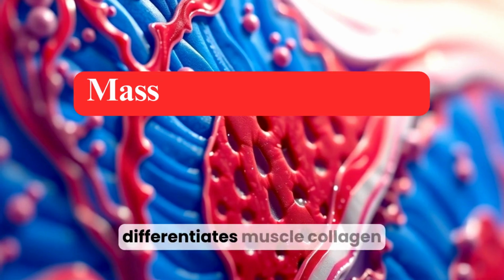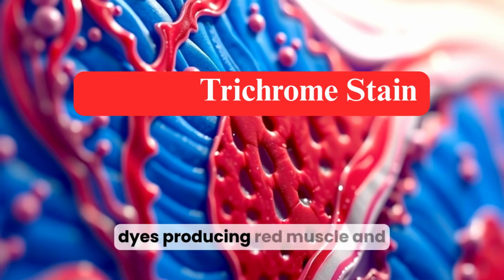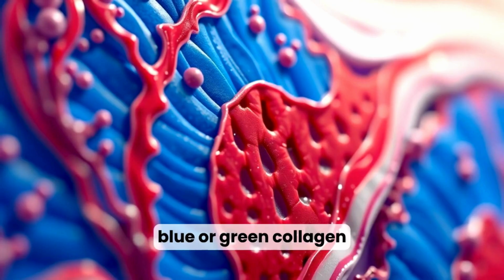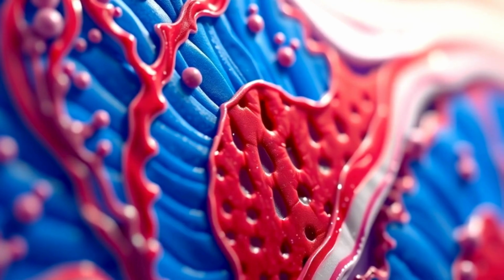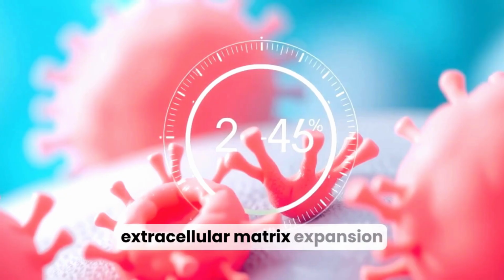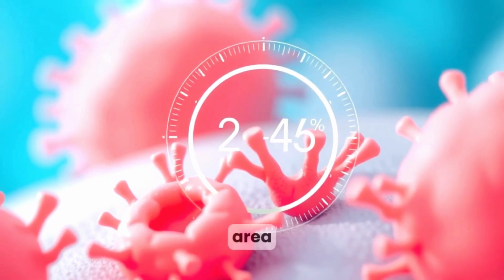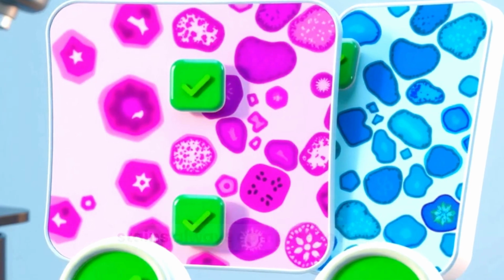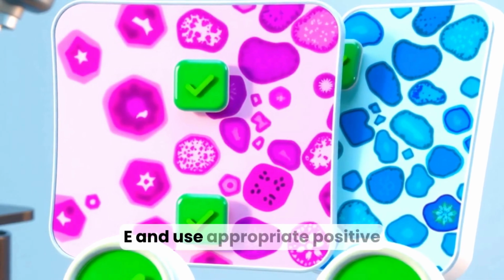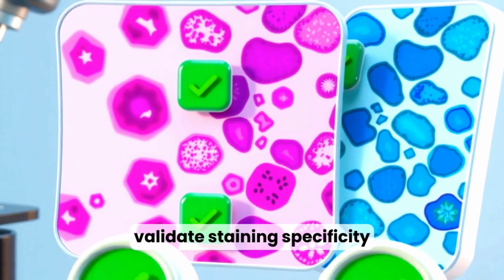Masson trichrome differentiates muscle, collagen, and fibrin by using multiple dyes producing red muscle and blue or green collagen depending on protocol. Trichrome stains are valuable for assessing fibrosis and extracellular matrix expansion. Quantification tools often measure the stained collagen area. When interpreting special stains, always compare to H&E and use appropriate positive and negative controls to validate staining specificity.